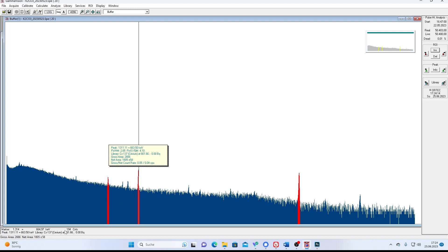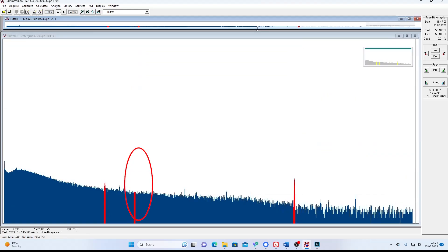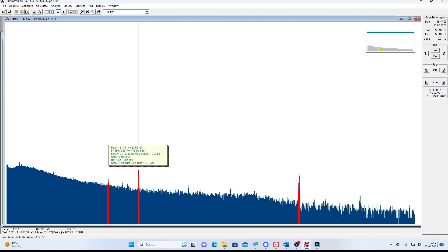Calculating cesium is relatively straightforward. Why? Fortunately, we don't have a cesium background as we can see in the background measurement. So I can confidently take the net area of 0.4 CPS, counts per second.